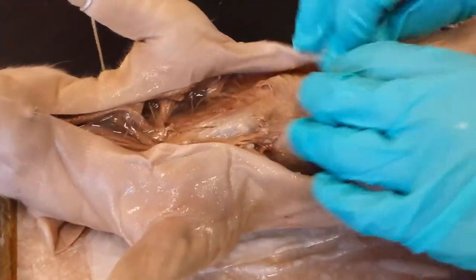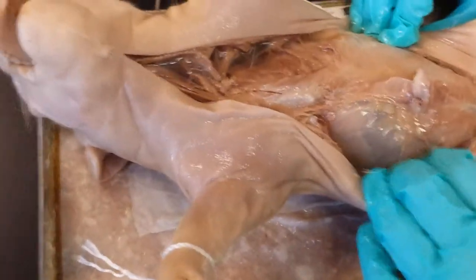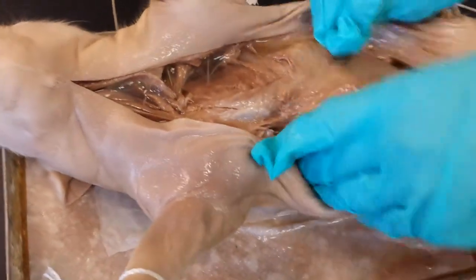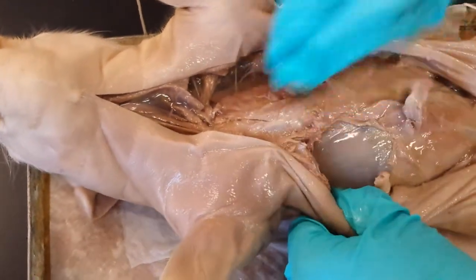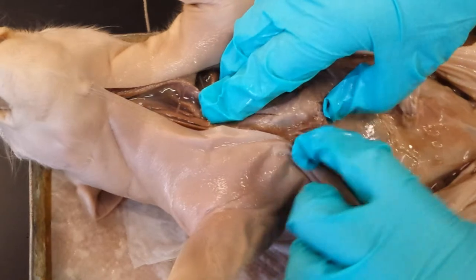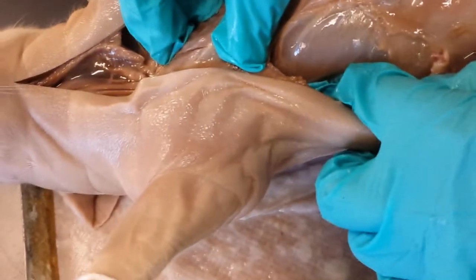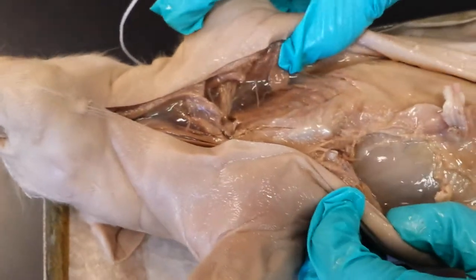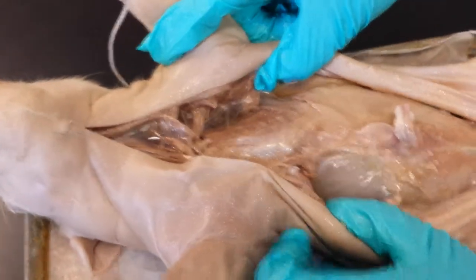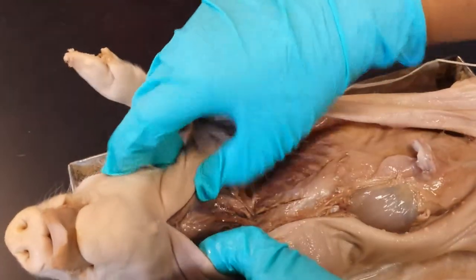Okay, but I can't see anything besides this huge sack, which I'm assuming is his stomach. But it's attached to his thing, so I'm not sure. Can't feel anything. Wait. No, yeah, this is definitely the stomach. You're right, that's the stomach. I wonder if you can see it. What am I doing? That's why they say you practice medicine. Yeah! I think that's it. That's a good one.